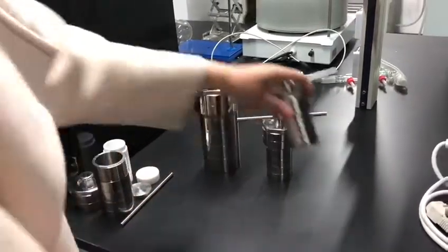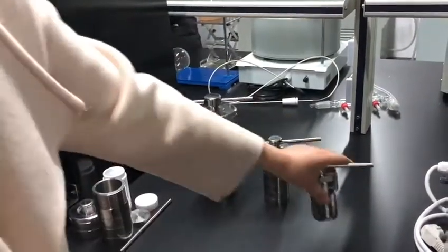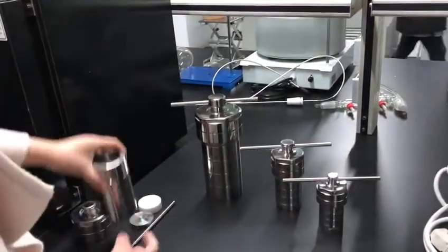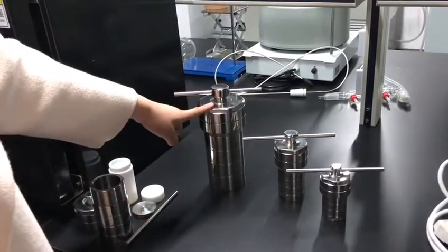This one is the smallest one. It's 25 milliliters, and then 50, 100, and the big one, 500.